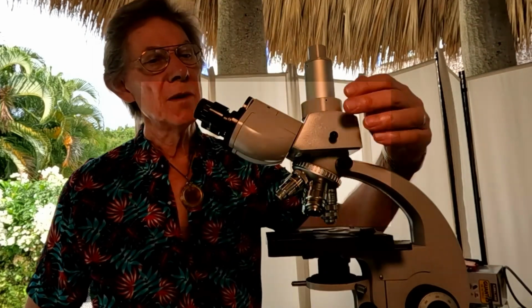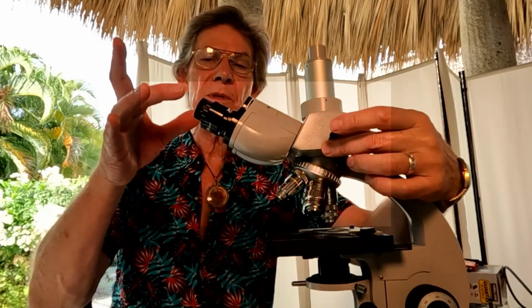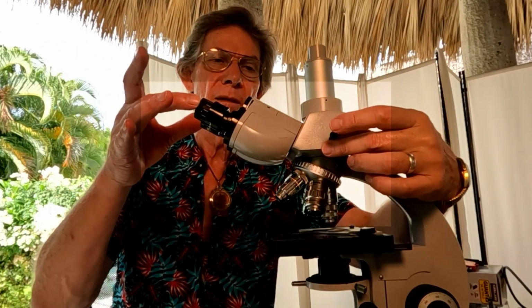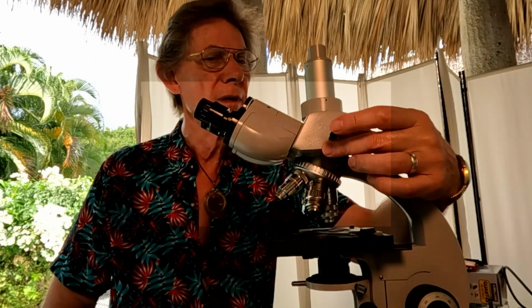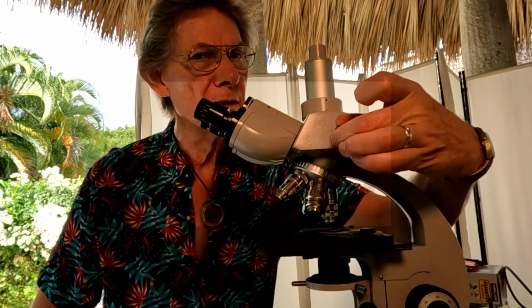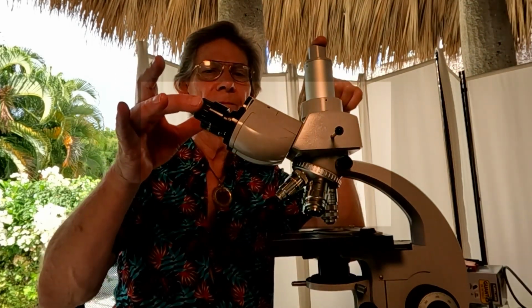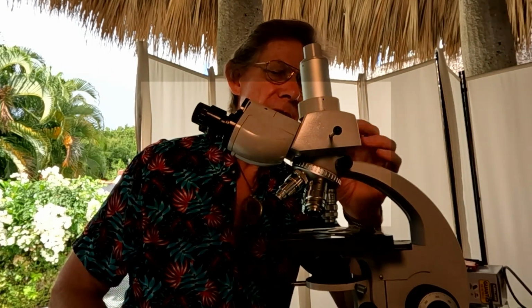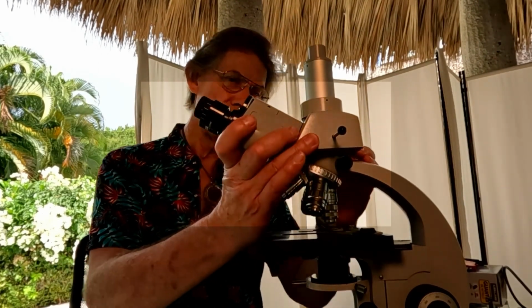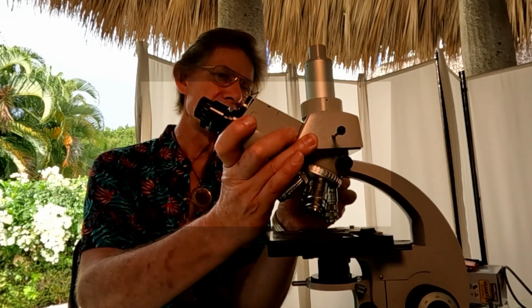This microscope also has another interesting feature in that it can be 100% of the light here, or it can split the image, which is what we need to do. So when I pull this out, we are splitting the image between here and here. That's a very important part of the concept. The reason being that we want to be able to take pictures of what we see.